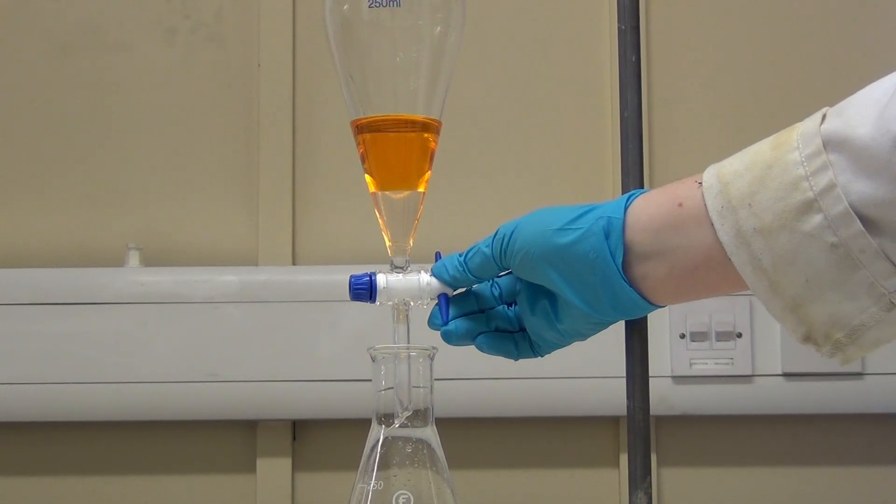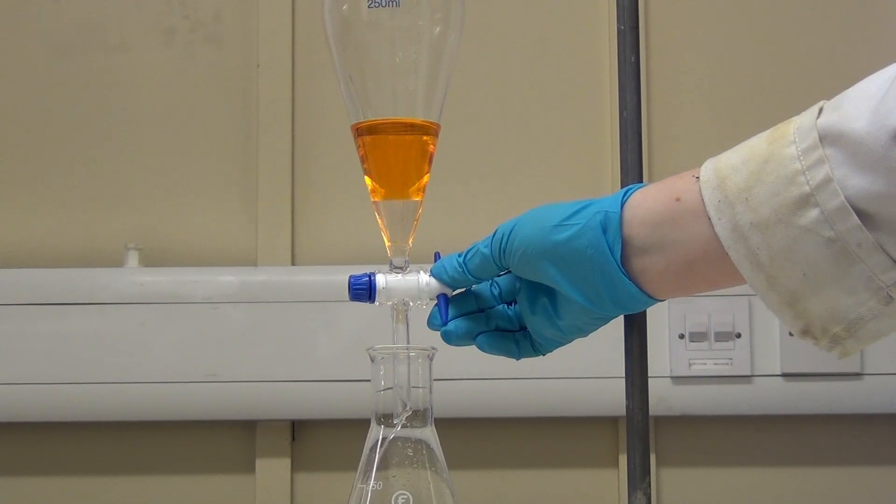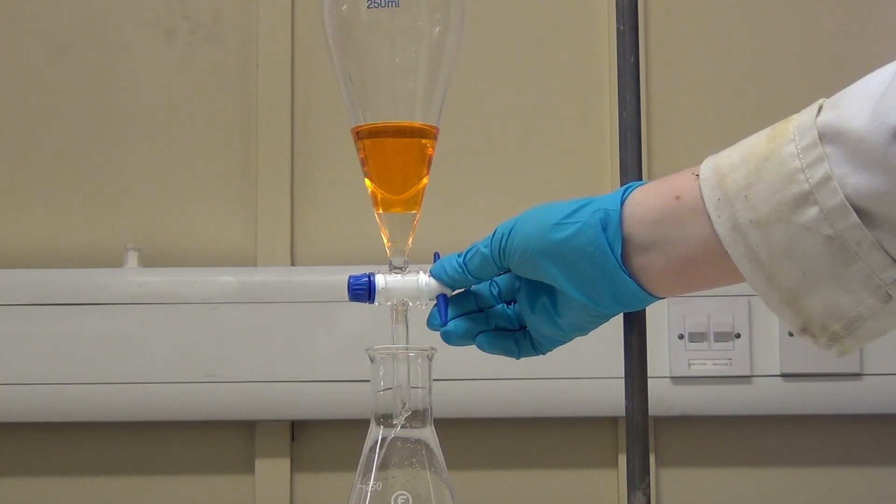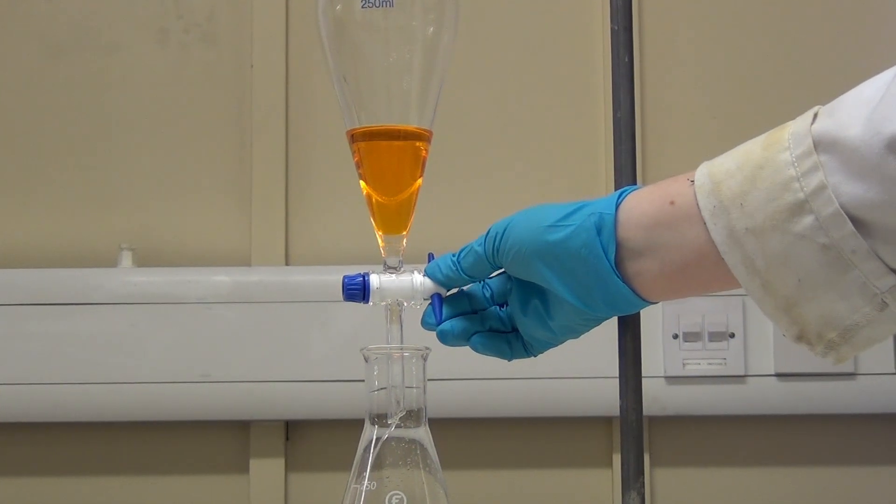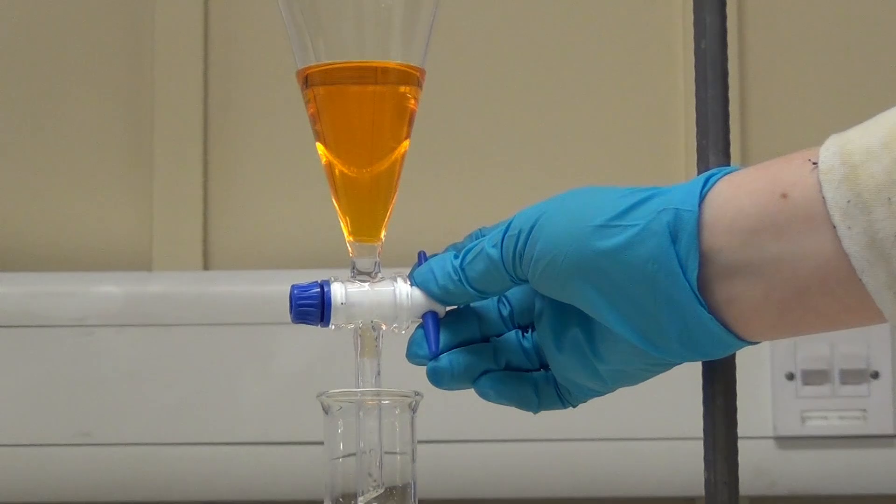Make sure you start to close the tap as the bottom layer drains out to slow the rate of flow, and to help you correctly close the tap when you can no longer see the separation between the two layers.